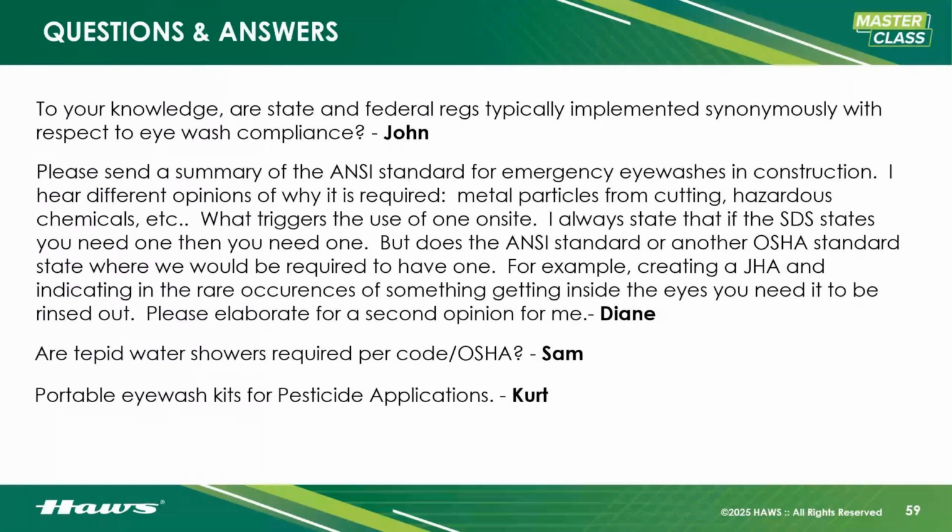Next question from Kurt. Portable eye wash kits for pesticide applications. Yeah, I highly recommend looking into a 7501. It's a portable, refillable, lightweight tank that can be just plopped down almost anywhere. We covered supplemental equipment, and sometimes it is what it is.